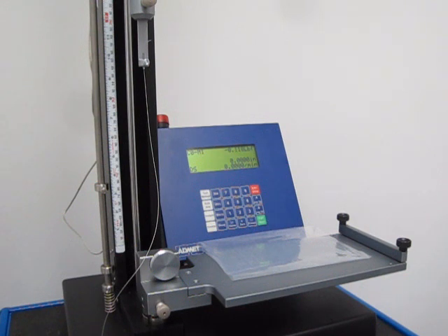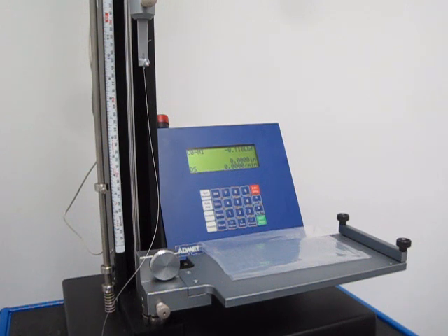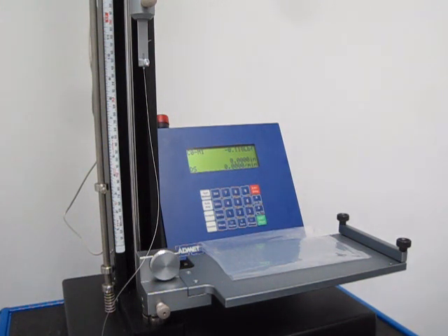This video is the coefficient of friction test. This test is programmed according to ASTM D1894, which provides the static and kinetic coefficient of friction.